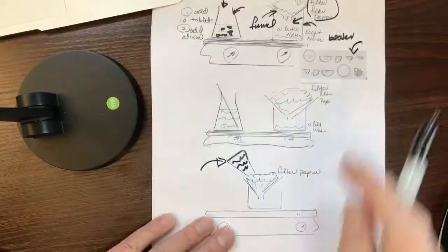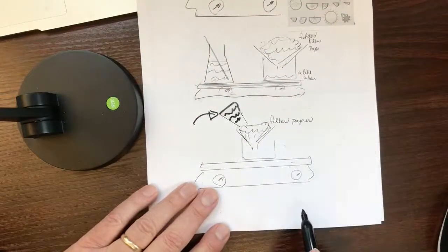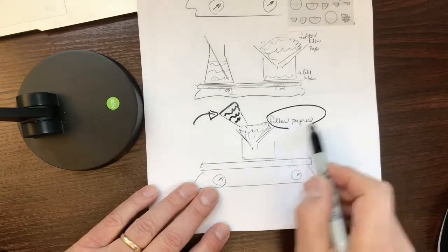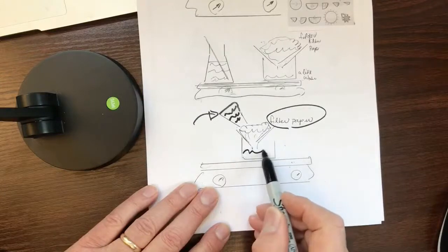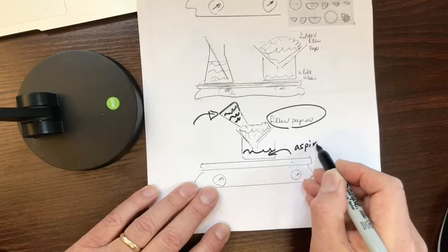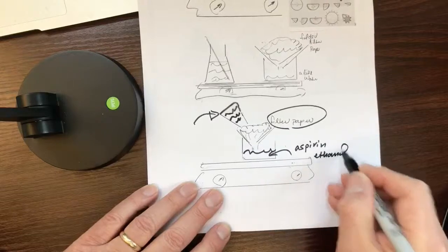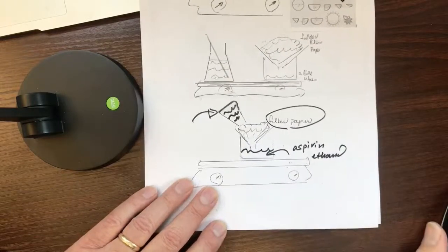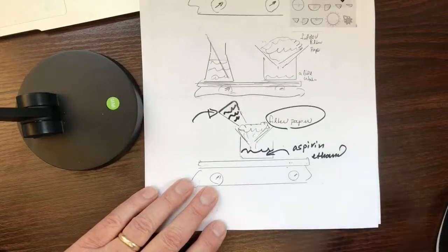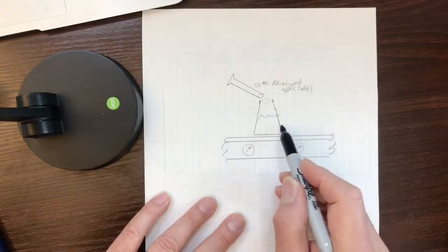We're going to filter and push the paper up. So we're going to filter the filler away from the aspirin. The aspirin would be here in ethanol, so we cannot really see it. Once we have the aspirin in ethanol, here it is.